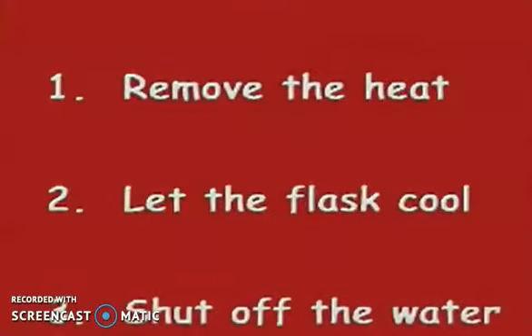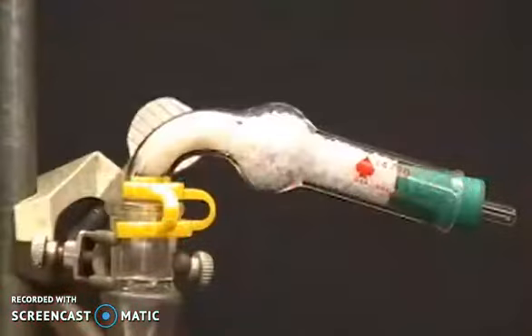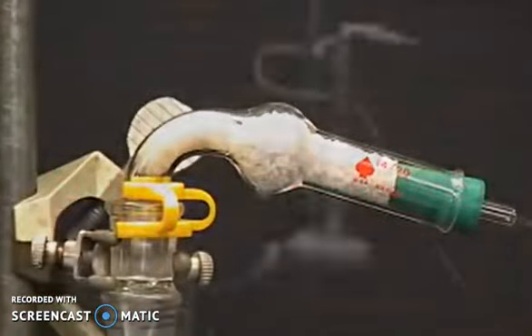Remove the heat after reflux finishes. Let the flask cool and shut off the water. During laboratory experiments you may need to run your reflux under dry conditions. Place a drying agent at the top of the condenser.